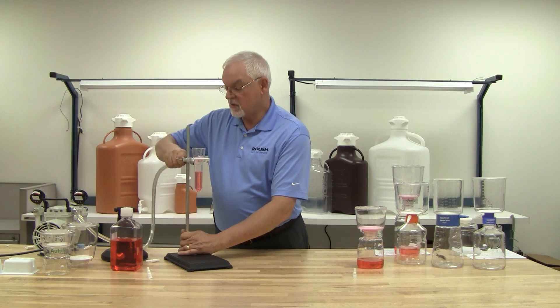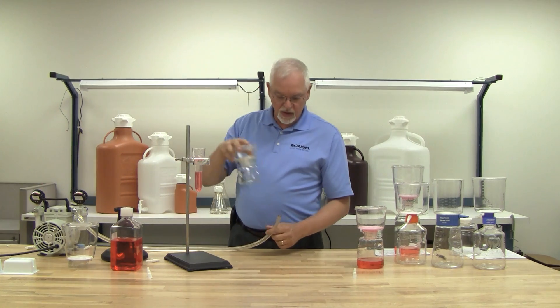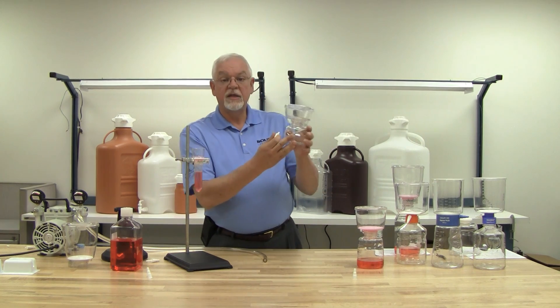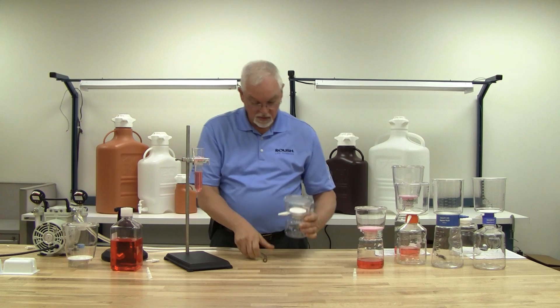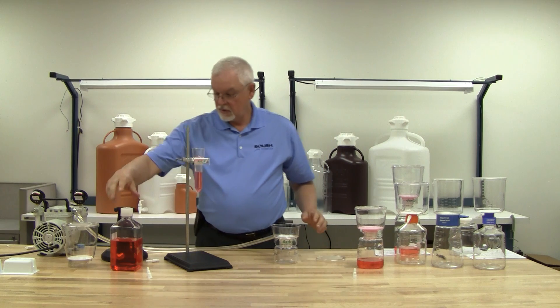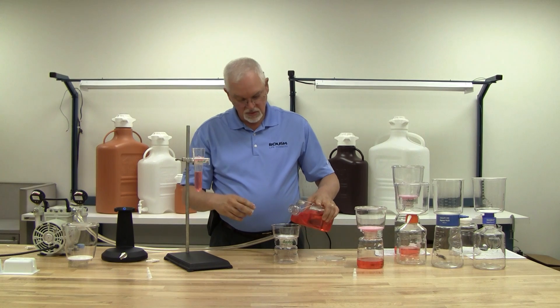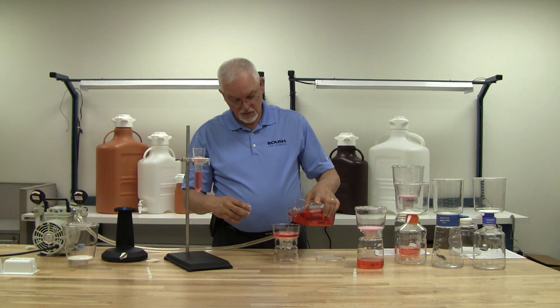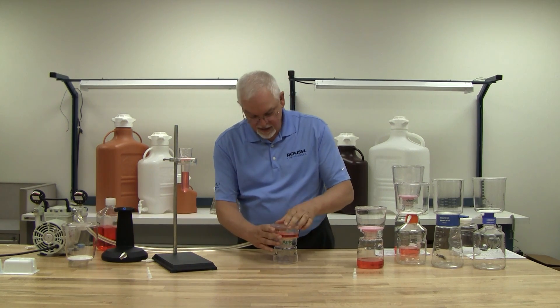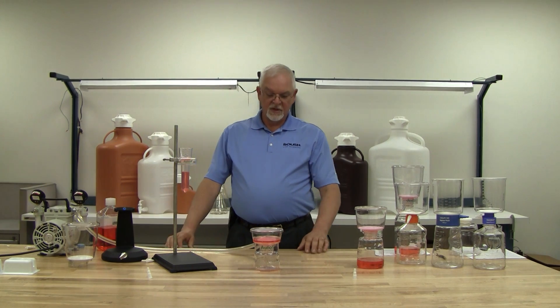For those labs that wish to use the traditional means of filtering instead of using the pedestal and the cradle ring, we always provide a tube adapter. It goes right into place. Put the cover on, turn it on, and off it goes.